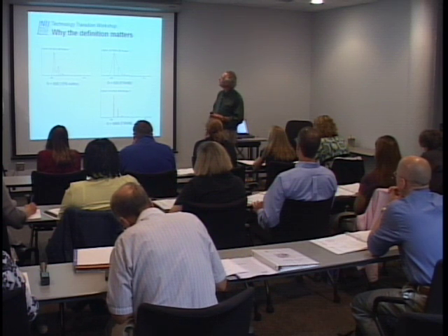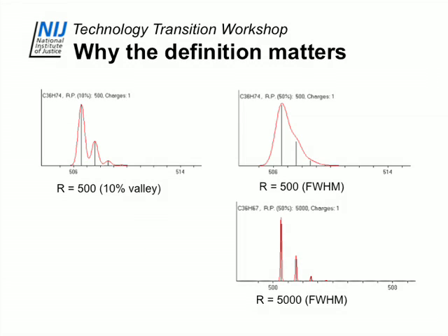Here's why the definition matters. You can define resolving power lots of different ways. You can talk about resolving power at half height, the width of a peak at half height, or you can talk about how low a value you can get between two partially resolved peaks.